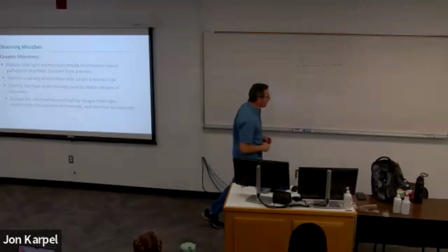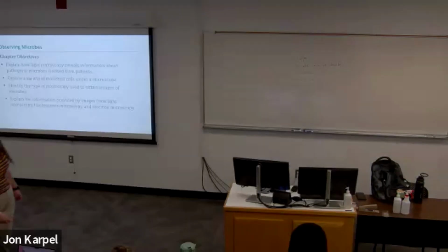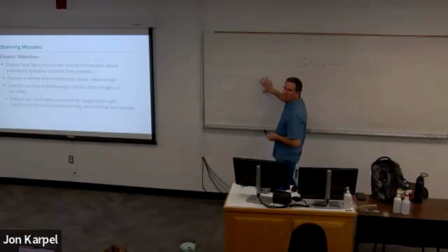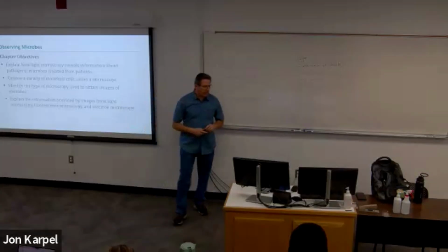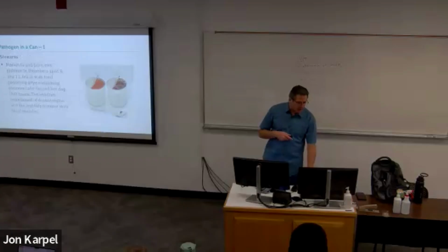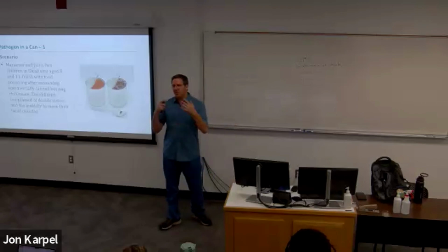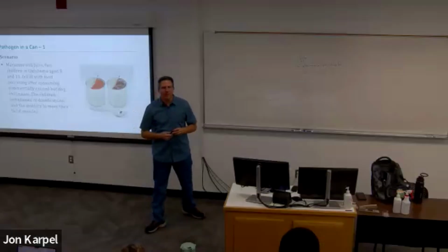Okay, so today we're going to talk a little bit about what microscopy is, what kinds of microscopy we have, how we get images, and then of course, why do we care? What does it allow us to do for microbiology, obviously, because that's what our class is. Some of these lecture slides are pretty nitty gritty. They'll show you the physics of light and that kind of stuff. I'm not going to test you on the physics part. You can take a physics class and do it that way, okay?